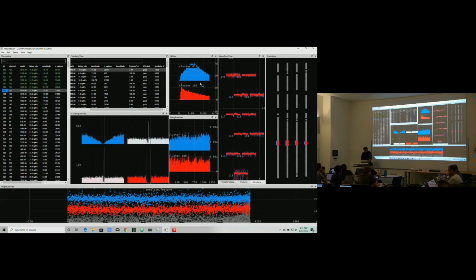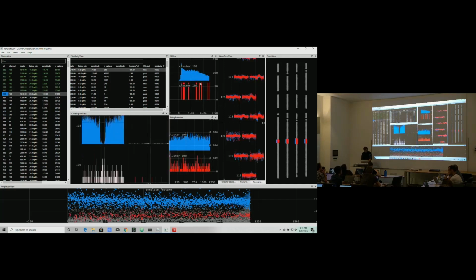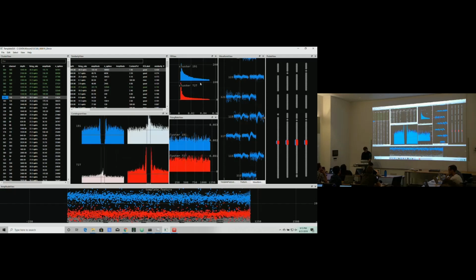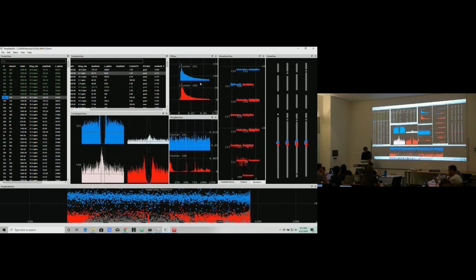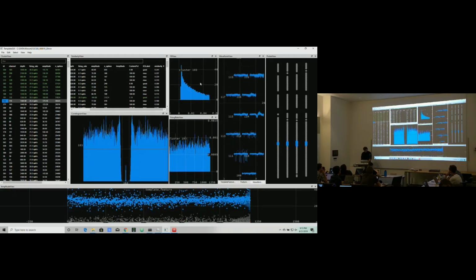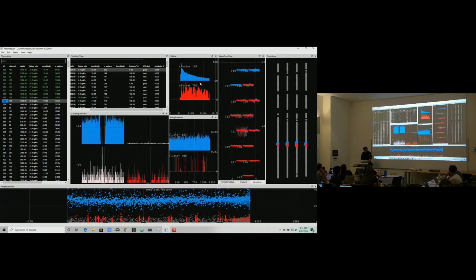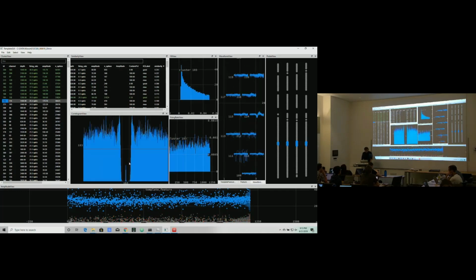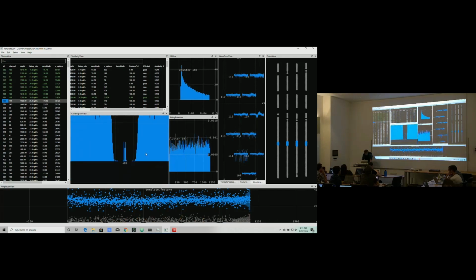Okay, I'm going to keep going with my manual curation. Okay, good. So you see, I press a few times space for every neuron to make sure there's nothing else around it. Now this one you see has a little bit of some kind of artifact here in the very middle, like almost coincidental.